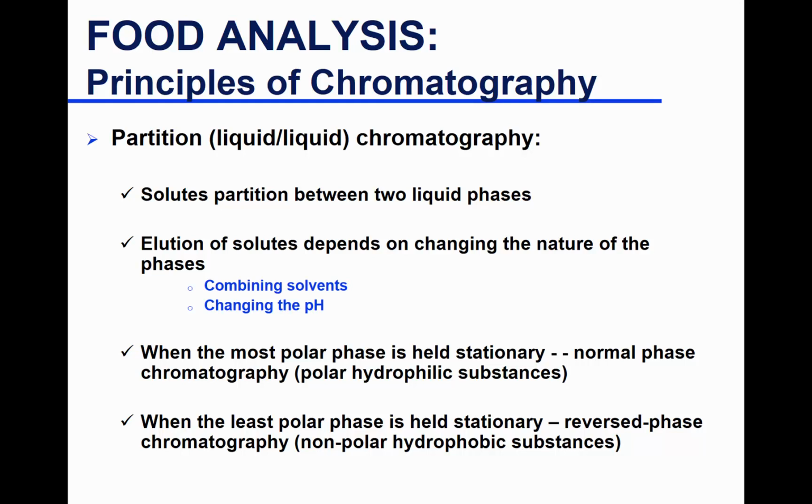When the most polar phase is held stationary, we talked about this is normal phase. And the opposite is true. When the least polar phase is held stationary, this is called reversed phase. And the only difference why one is normal and one is reversed is what started first.